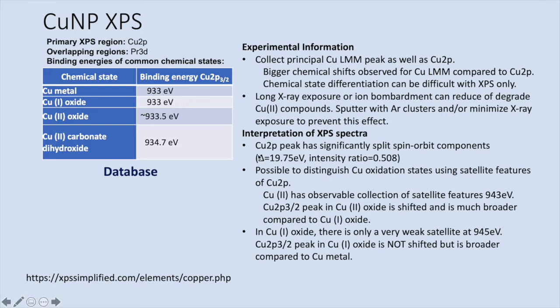This will also tell you the energy split and the intensity ratio is 0.508 — though usually it's 0.518, so I'm not sure if that's an intentional difference or a typo on the site. I think we have to relax this to fit even the pure copper 2P spectrum.